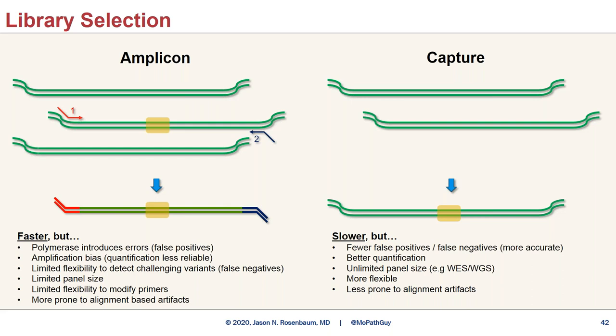So the capture methodology is slower, but is more accurate. It has fewer false positives and false negatives. The coverage is more even because there is not as much concern about amplification bias.